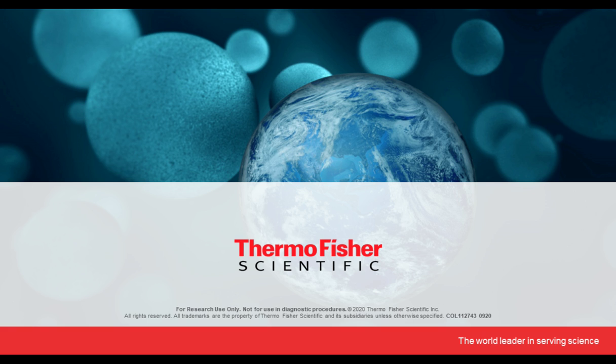But again, there are certain targets that we have seen where there would be some interference because of this. Now those are very few and far between, but it is really possible that depending upon your target protein, it would be good for you to analyze if there is any kind of interference or not, before adopting it completely for that particular experiment.